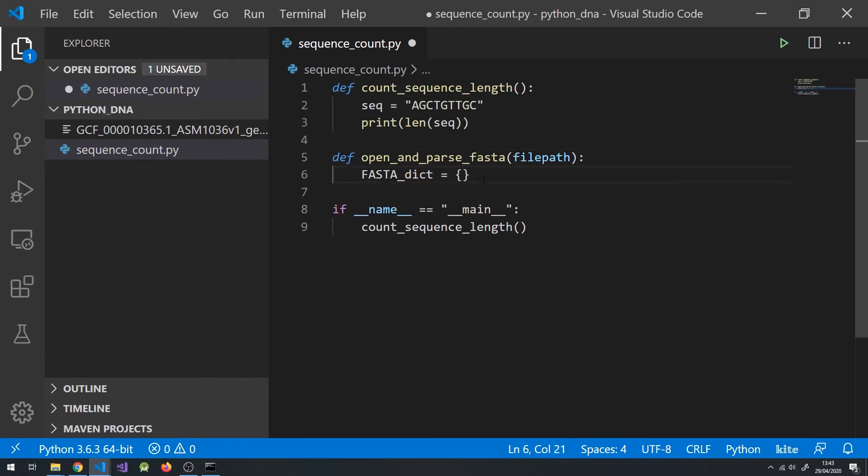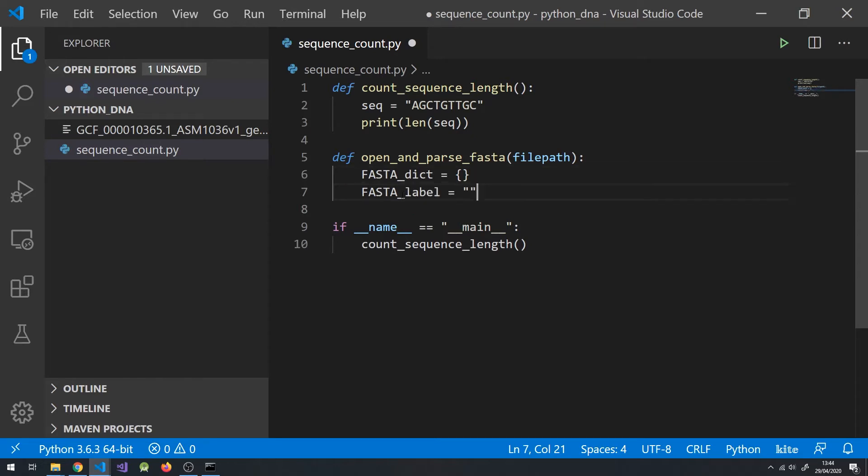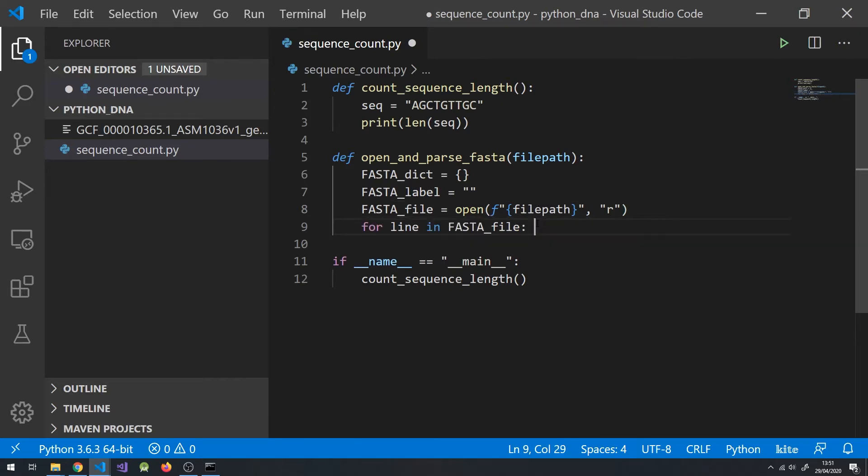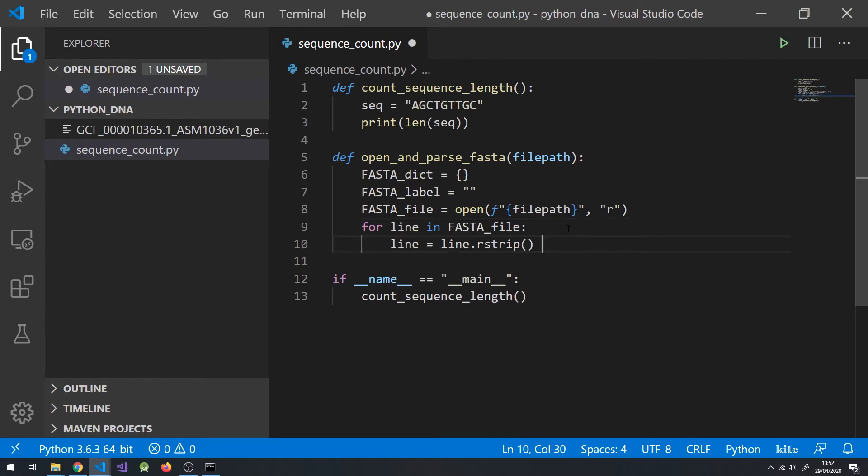Make a variable to store our FASTA dictionary, which is just a collection of key-value pairs, so we can store multiple sequences. A variable to store the sequence label identifiers as we go through the for loop. Next, we need to open and read our FASTA file using the open function, which takes in two arguments: the file path and an action, in our case read, and loop through each line of our FASTA file.